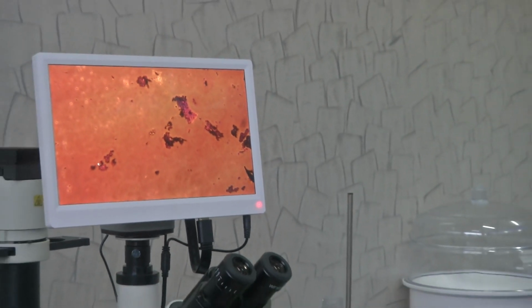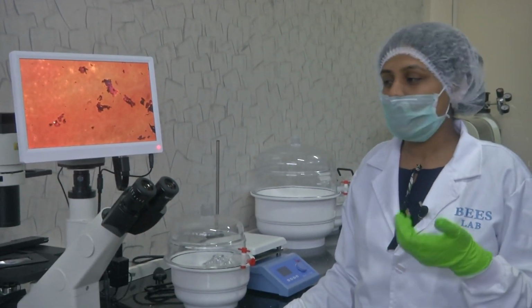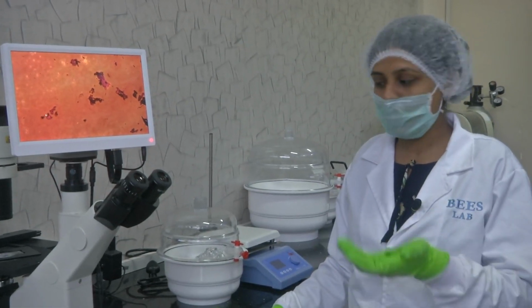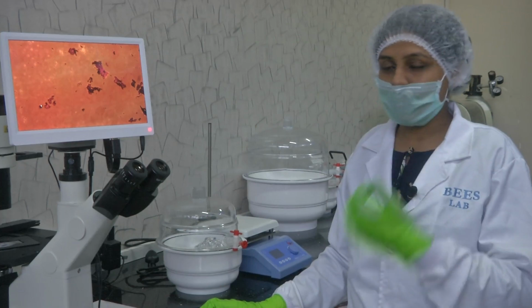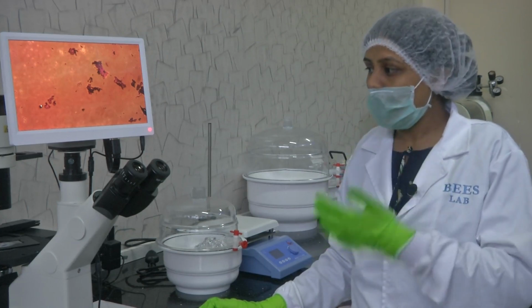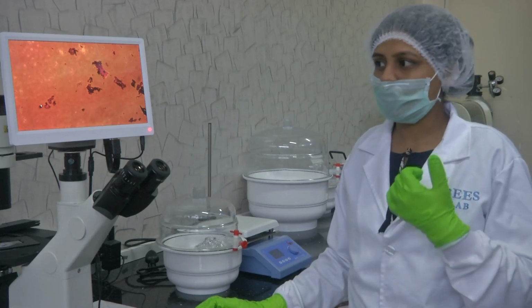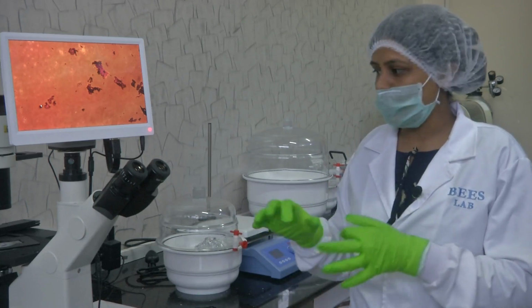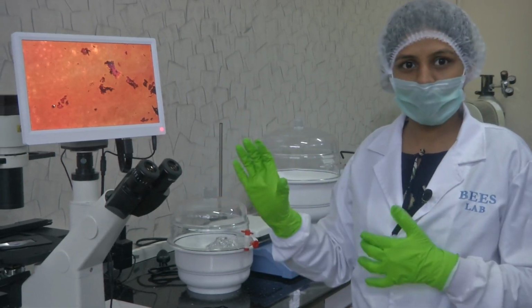Like I said, when you are studying cancer cells which are highly invasive and you want to see the cell growth, or understand different parameters of live cell imaging, or when they are in petri dish cell culture, the entire petri dish could be placed in this slot and you could record and study their properties and invasiveness. It allows you to research how growth factors would be affected by different environmental conditions, or study them while altering their environment. All of that can be studied using the inverted microscope.